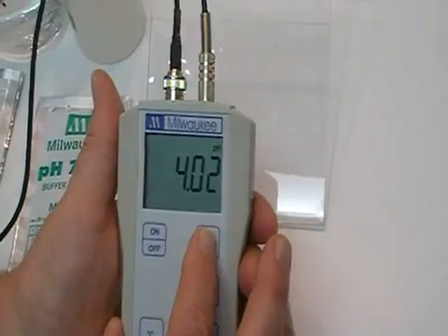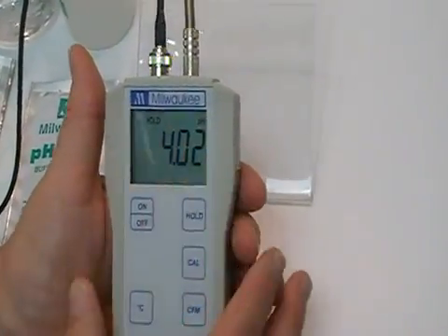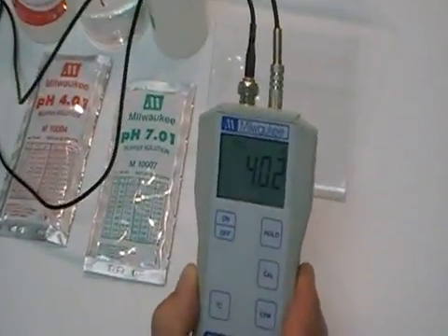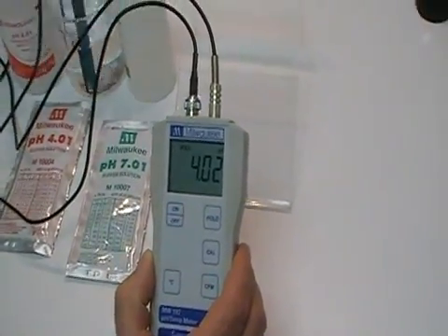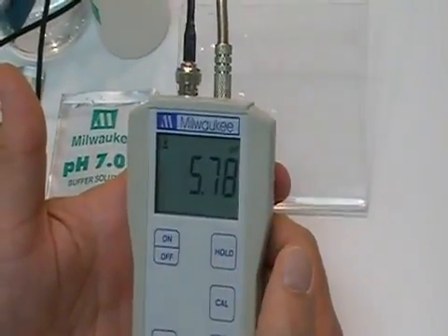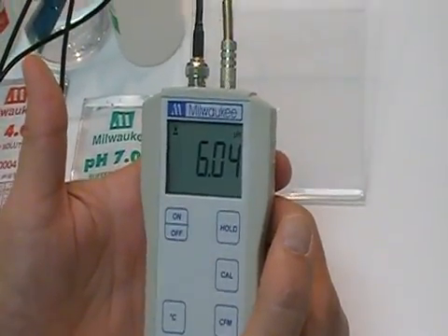Now here's your hold feature. Press your hold button — you'll notice that 'hold' is displayed on your screen. When you pull the probe out, there's no change on your display. When you go back in — we're going to put it back into this tap water — and when you release the hold, you just press the hold button again, and it's coming back in to read that tap water.